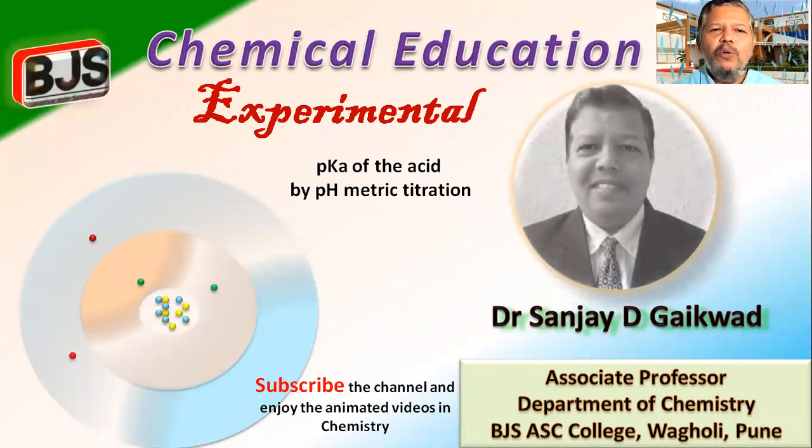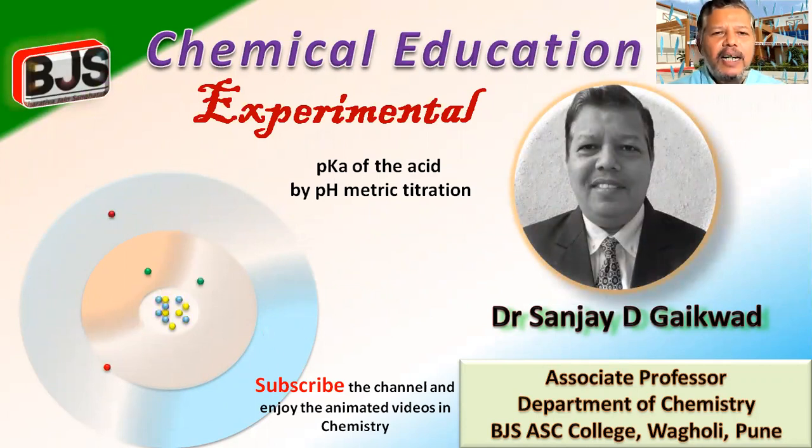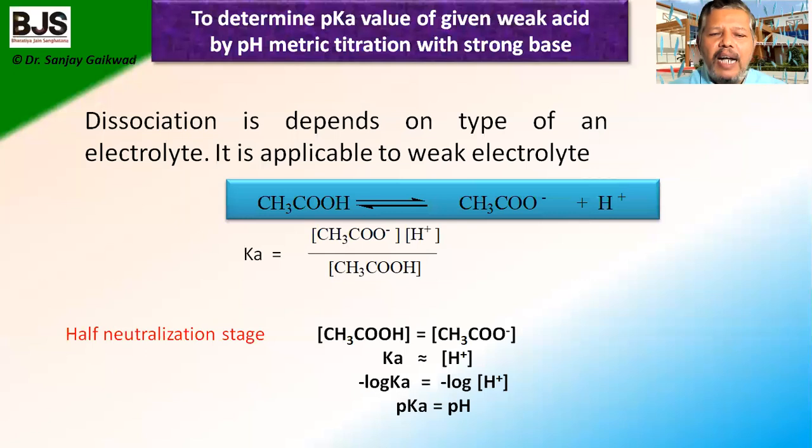In this video, we are going to see the experimental part. It is related to pH metric application: determination of the pKa of a weak acid with the help of pH metric titration. The title of the experiment is to determine the pKa value of a given weak acid by pH metric titration with a strong base.